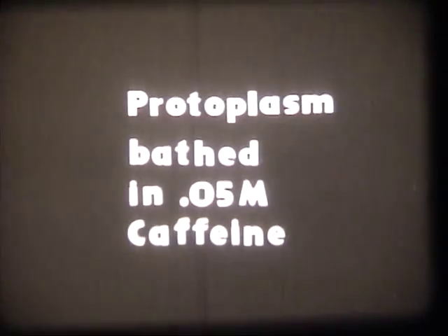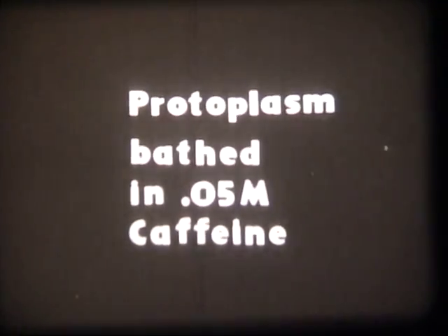I have done much work on toxicity, observing the effects of poisons. Here is what sulfur dioxide does to protoplasm. If anesthetic agents gelatinize protoplasm, stimulants should have the opposite effect, and so it proved. They liquefy protoplasm. The protoplasm here is literally pouring out into the surrounding medium, going into solution.